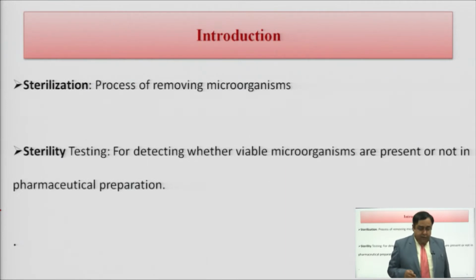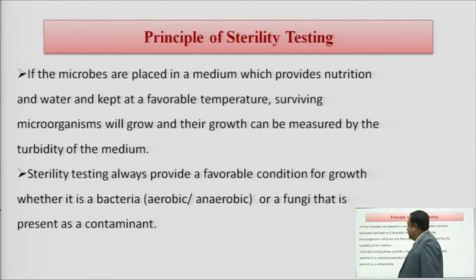To be more specific, sterility testing is done for detecting whether microorganisms are present or not in the pharmaceutical preparation. This is the objective of sterility testing.